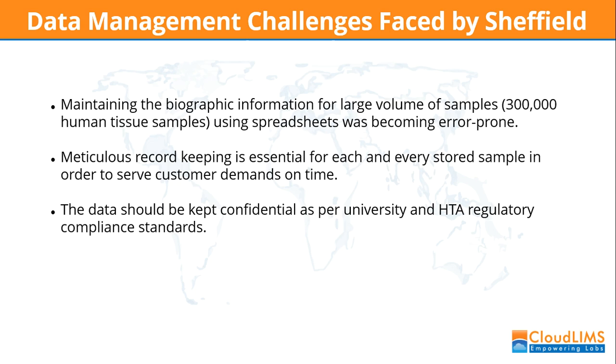To overcome these challenges, we had to start looking for a reliable LIMS system to track samples within the biorepository. Finally, we began analysing the benefits of cloud-based software against on-site solutions to find the best application that could cater for our needs.